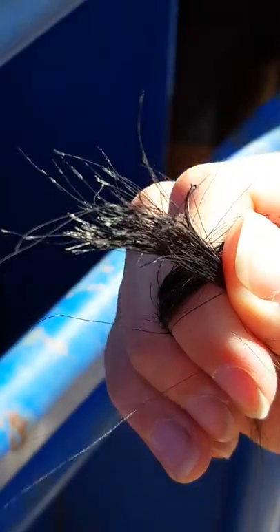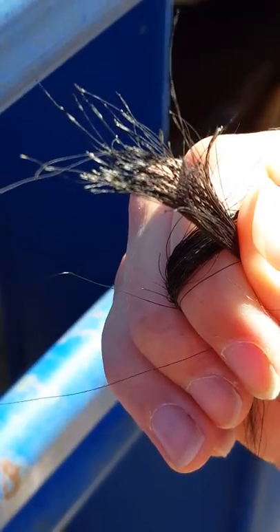As you can see, there's root bulbs attached — it's the little hooks at the end of the tail hair. You want to put it on the card.